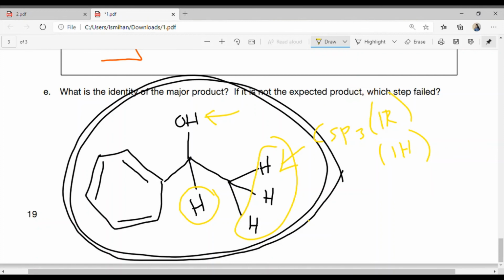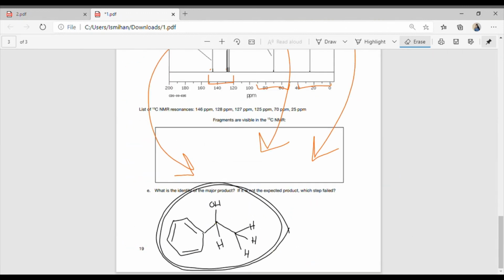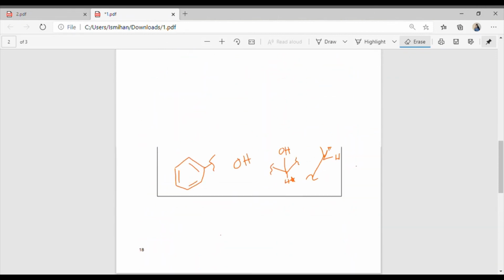And we know that this carbon couldn't really attach itself to anything but the rest of the molecule, so it had to be attached to the molecule. And there's only one hydrogen on this connection. And then the arene, it was pretty obvious to see in all the occasions, just because arenes are one of those molecules that have properties that nothing else does. And yeah, so if you're having trouble with this, I would just make sure to watch more practice videos on how to do them. That really helped me learn this at first.